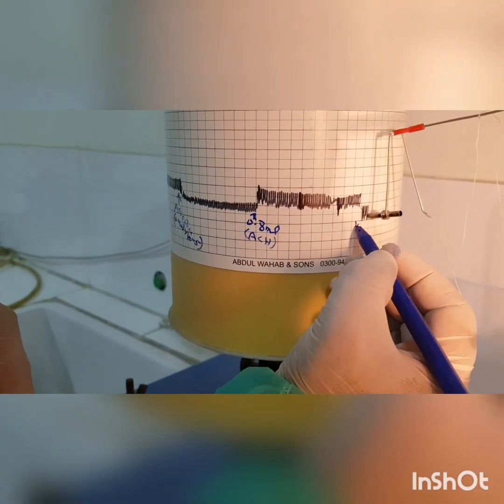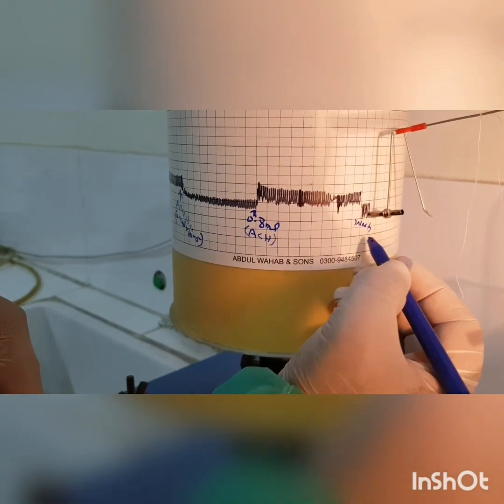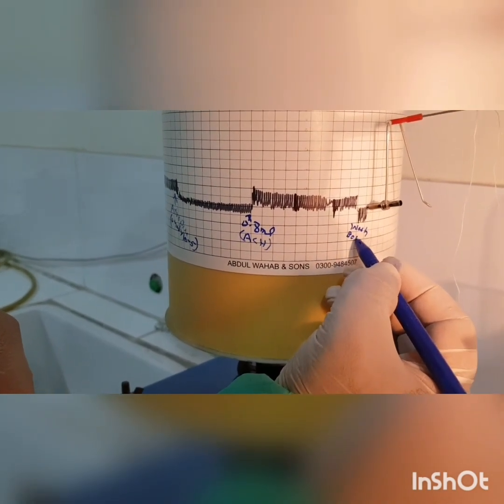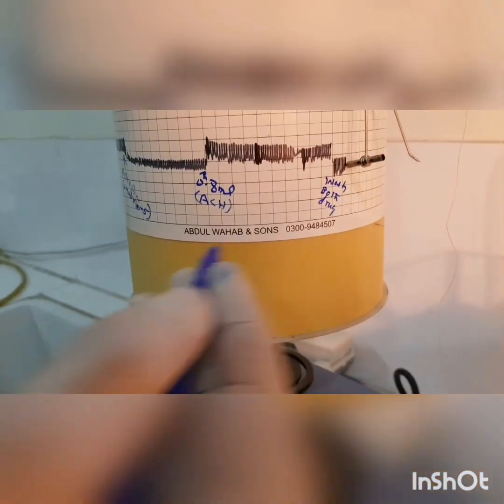Now we wash out both the drugs, acetylcholine and also atropine.